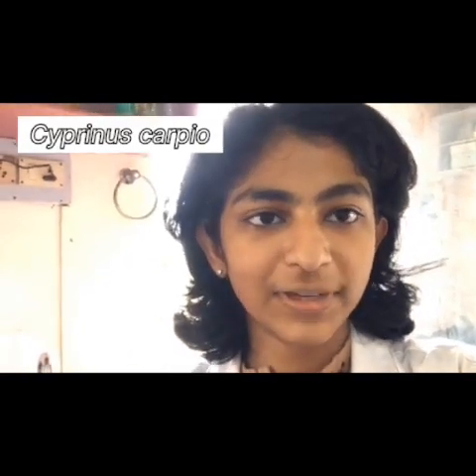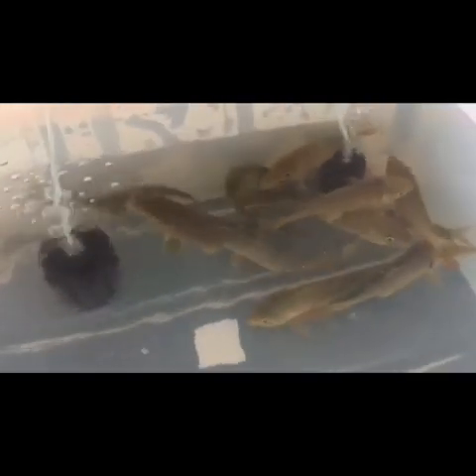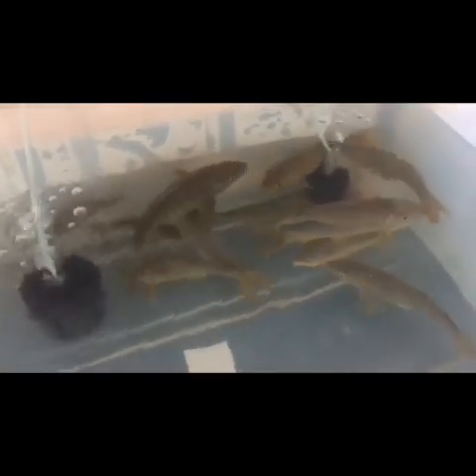Now what I'm about to show you is the fish that we use for research. These are Cyprinus carpio, also known as the common carp. These are the largest ones, and they weigh around 250 grams. And the smallest ones weigh around 60 to 80 grams.